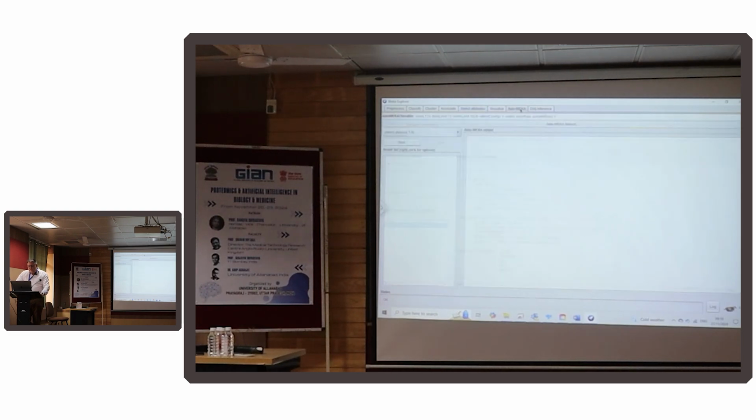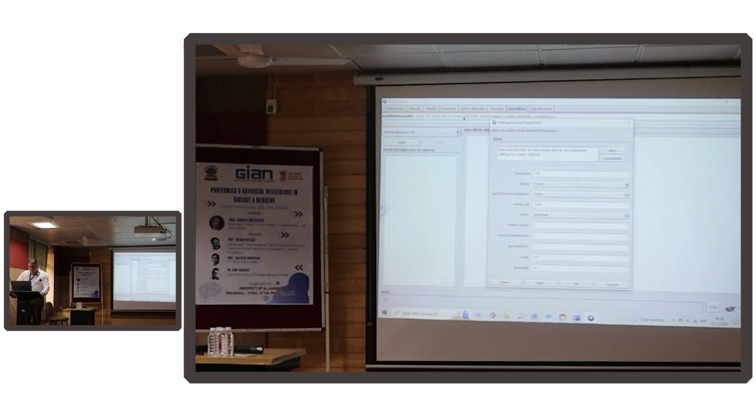The next one I'll just show you is AutoWeka. So here what we do is we're literally setting up an experiment and telling it what to look for. This tells us how many things to look through, batch size, how much memory to use, the number of best configurations. This is just looking for the top single best configuration out of them all. But maybe we don't want to just rely on one. We might want to select 5 or 10. Give us the top 10 rather than just the top 1.